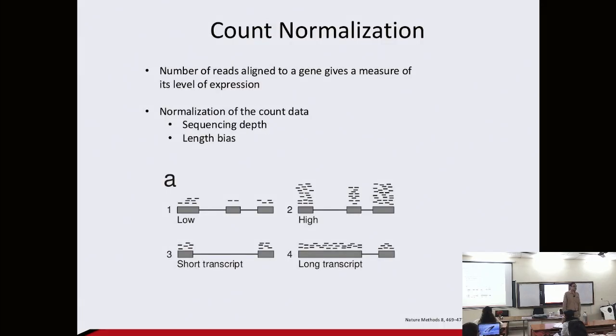Some genes have 10 times sequence, some genes have 1 time sequence. So to make the sequencing rate. Okay, yeah. So not gene actually, sample sequencing you have to say, because samples are sequenced. So bulk RNA-Seq, so the entire sample is sequenced. So some samples may be sequenced many-fold more than others.